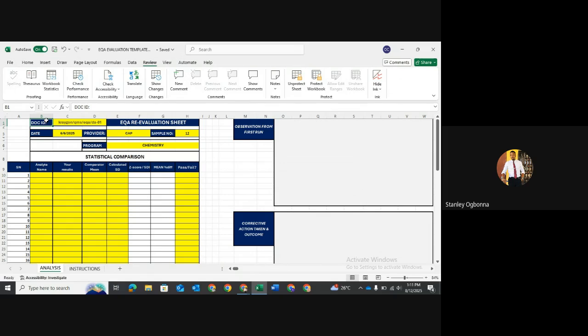It's done that way to preserve the structure of your software so that someone does not mess it up for you. And that brings me to the yellow cells. The yellow cells are the cells you can edit. So this is a yellow cell. This is a yellow cell. All these are yellow cells. This whole area is made of yellow cells because these are areas where you have the ability to edit, or make your data entries if need be.